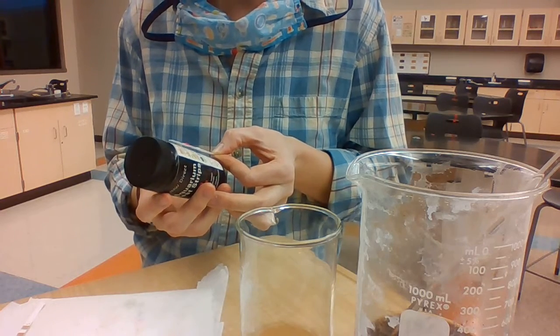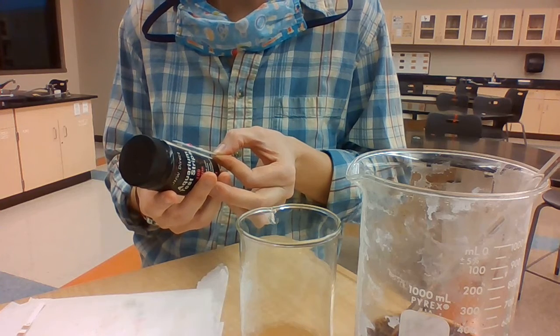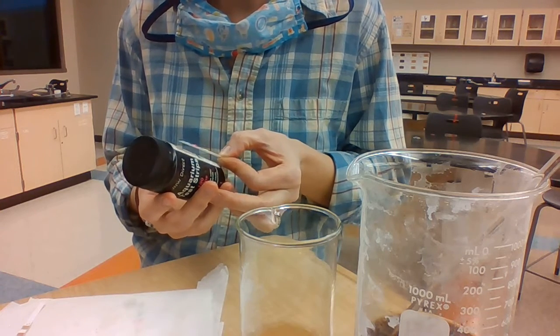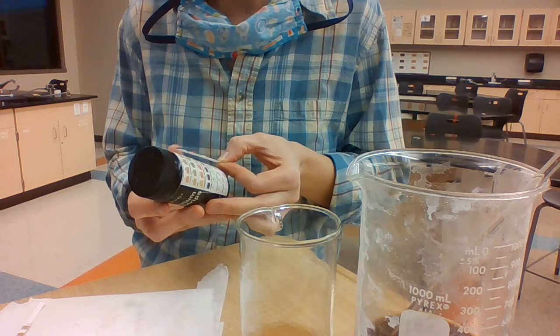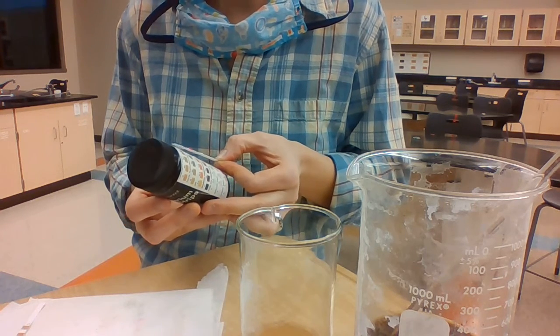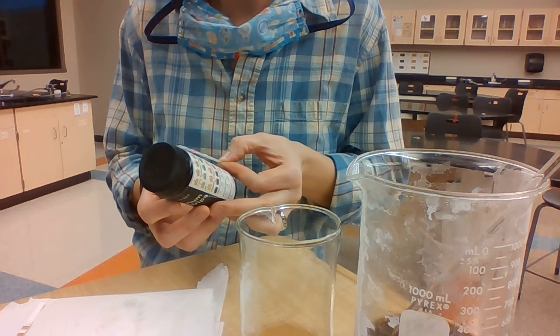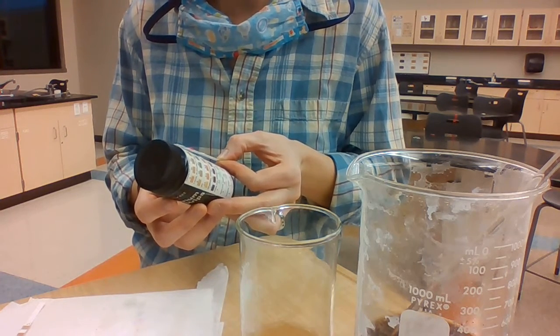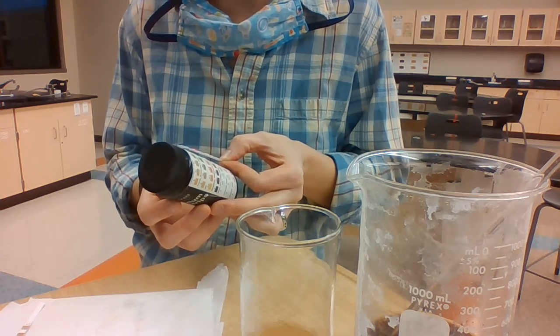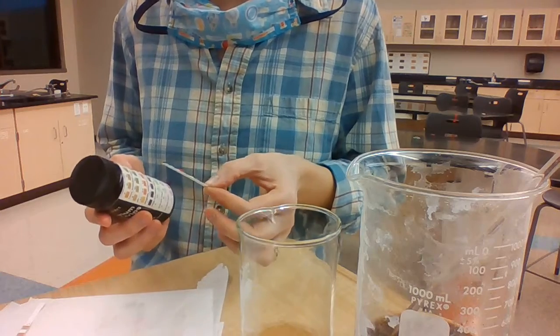General hardness, I'm going to say, is 0. pH is still a 9. And total alkalinity, I'm going to say 240. It's really hard comparing these colors, but I'm going to say it's about 240.